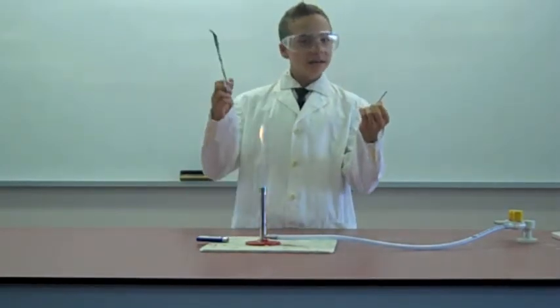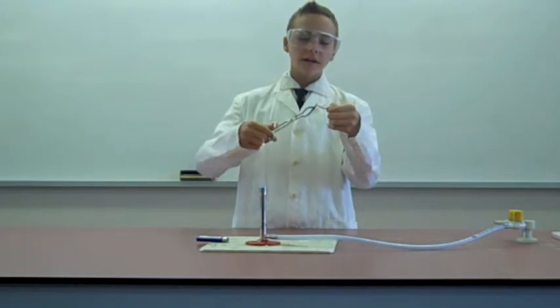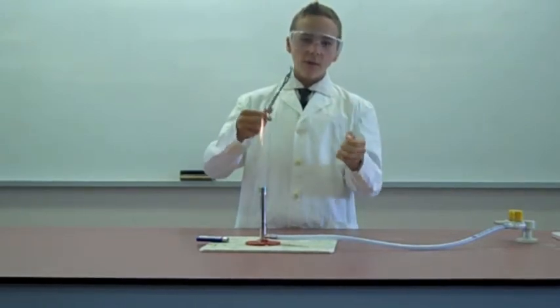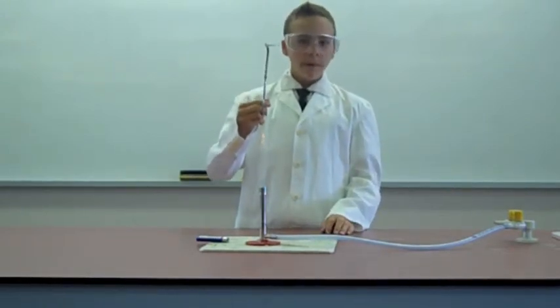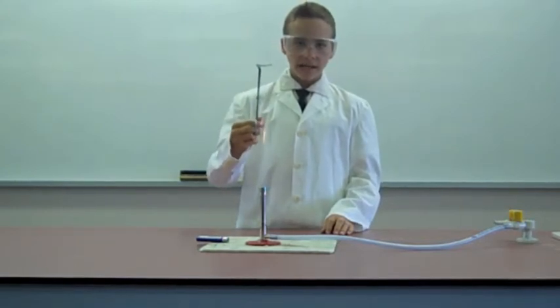Now, get your magnesium and your tongs, and very carefully hold them over. Remember not to look directly at the magnesium.